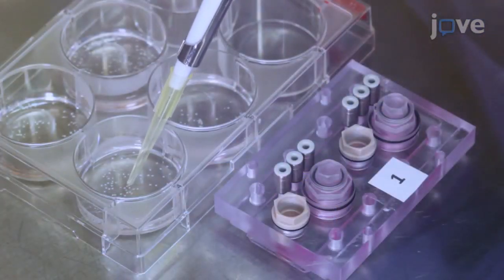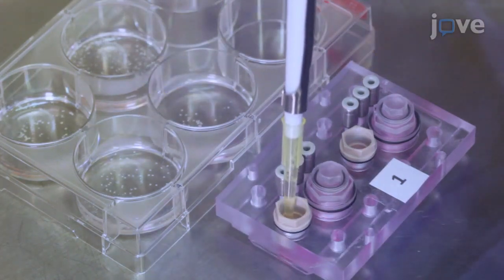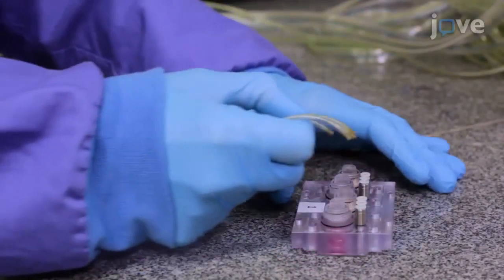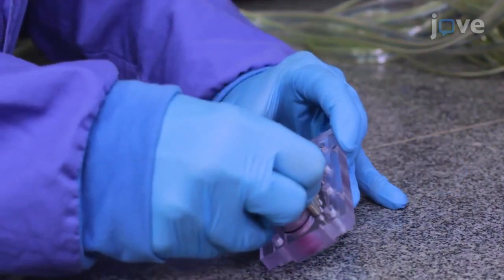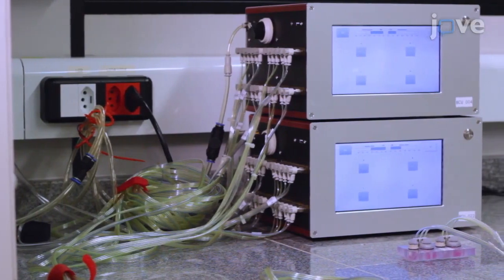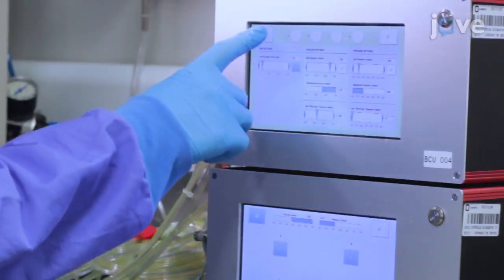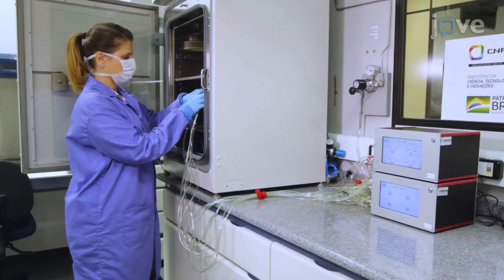Using wide-bore tips, integrate 20 liver equivalents per circuit into the smaller compartment of the two-organ chip and connect the system to the control unit. Then connect the control unit to a pressurized air supply and set the pressure to approximately plus or minus 300 millibars and a pumping frequency of 0.3 Hz.